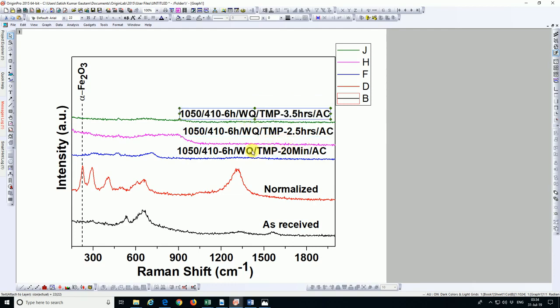Okay. So we'll continue. Now I want to analyze this peak. I want to know what the oxide for this peak is. It is 294. So it should match some wave number in the reference table, and I will write the corresponding oxide.